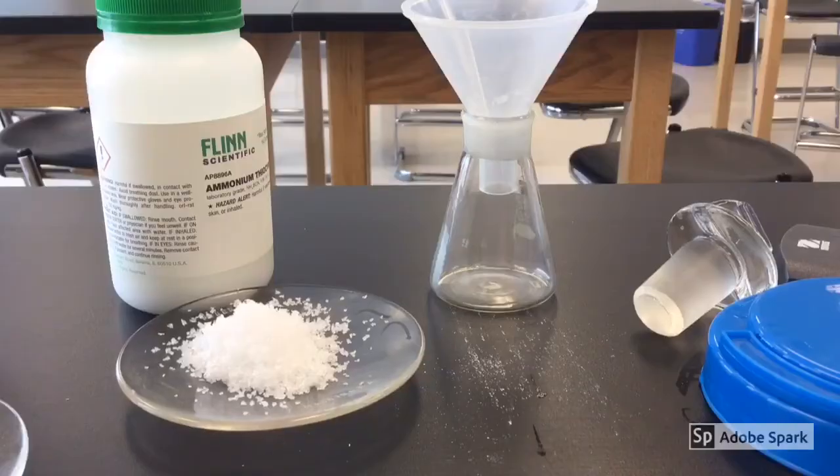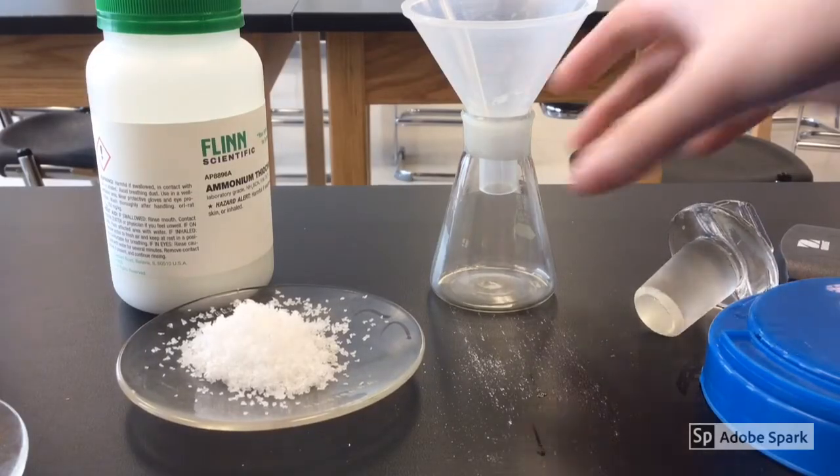Hello everyone. Today we are going to be doing a demonstration called Cool Reaction. I've got my safety goggles on and we're going to get started. So like mentioned, we're doing a Cool Reaction lab.